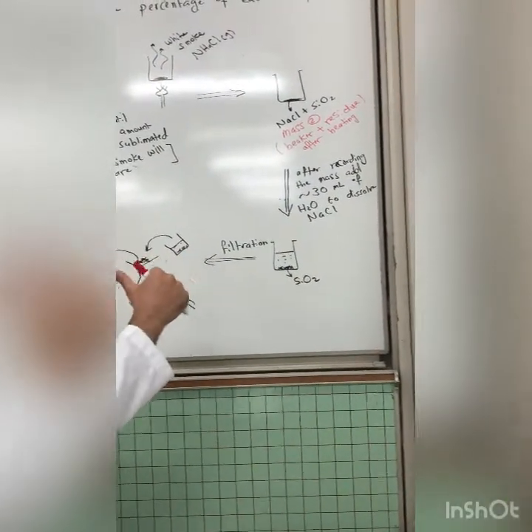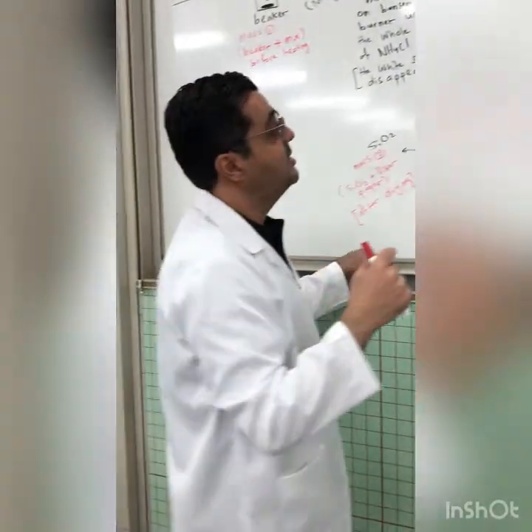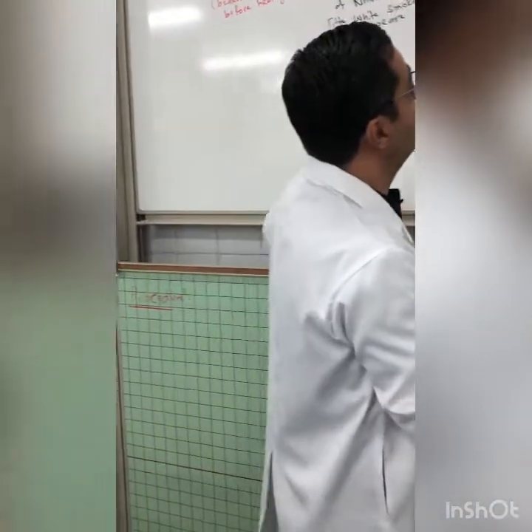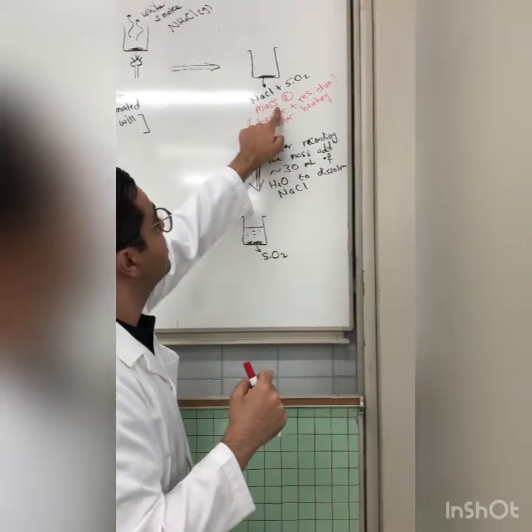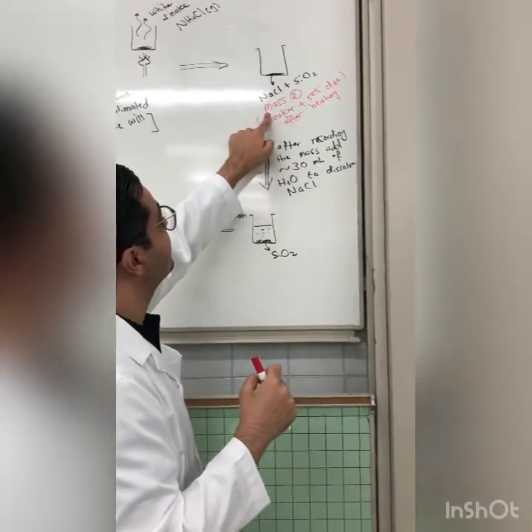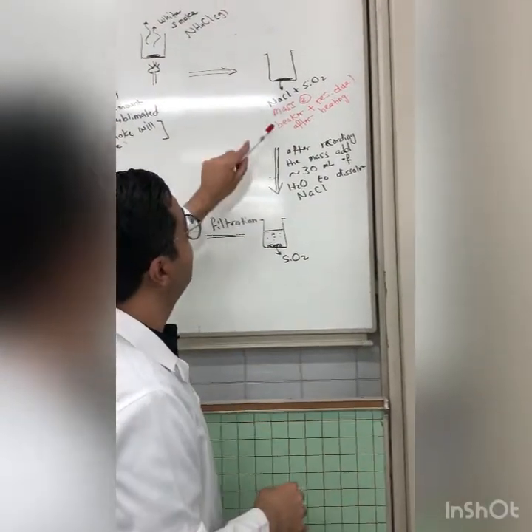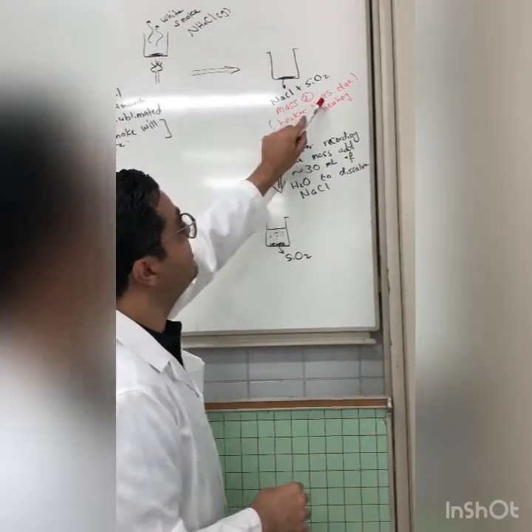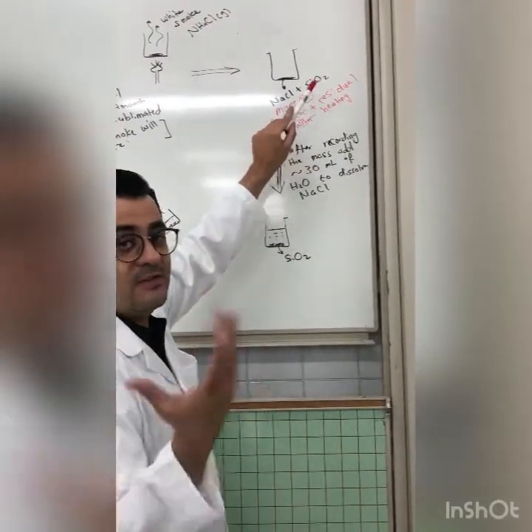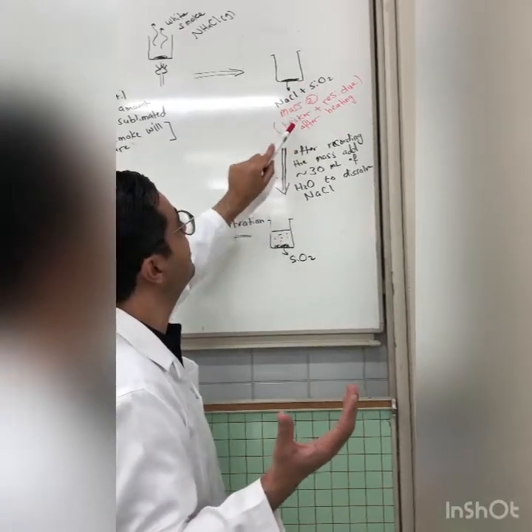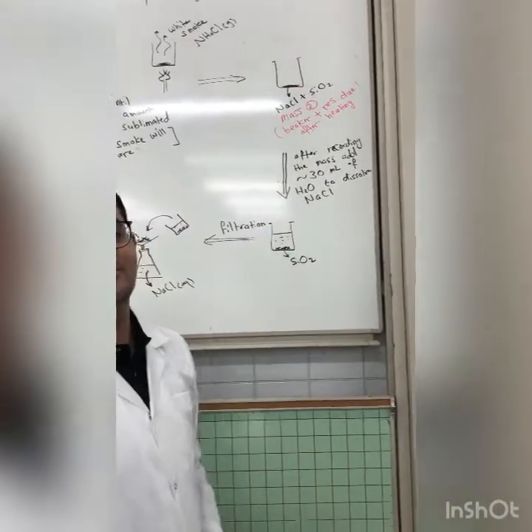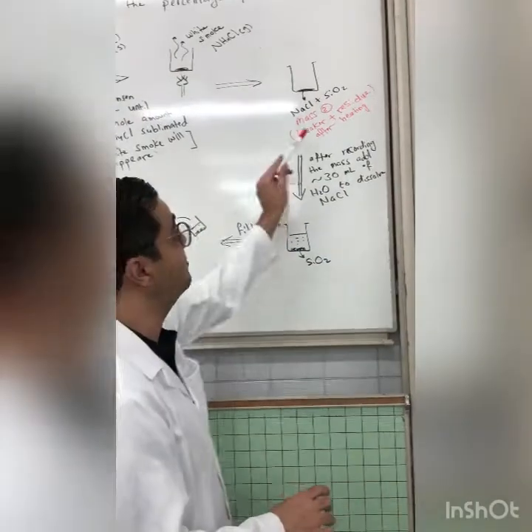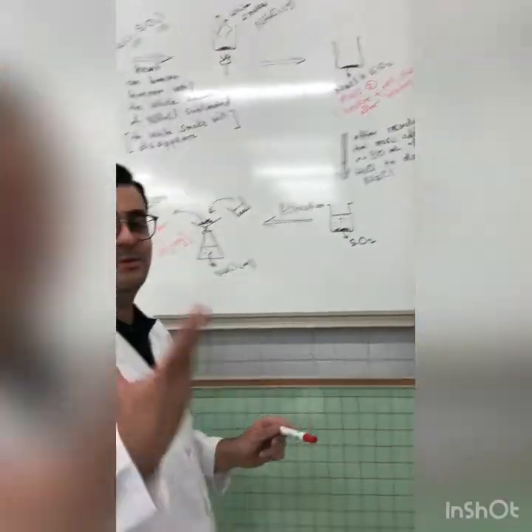Before proceeding to the next step, we record Mass number two, which represents the mass of the beaker plus the residue. The remaining materials are sodium chloride and silicon dioxide. This mass is very important and will be used in the calculation part.